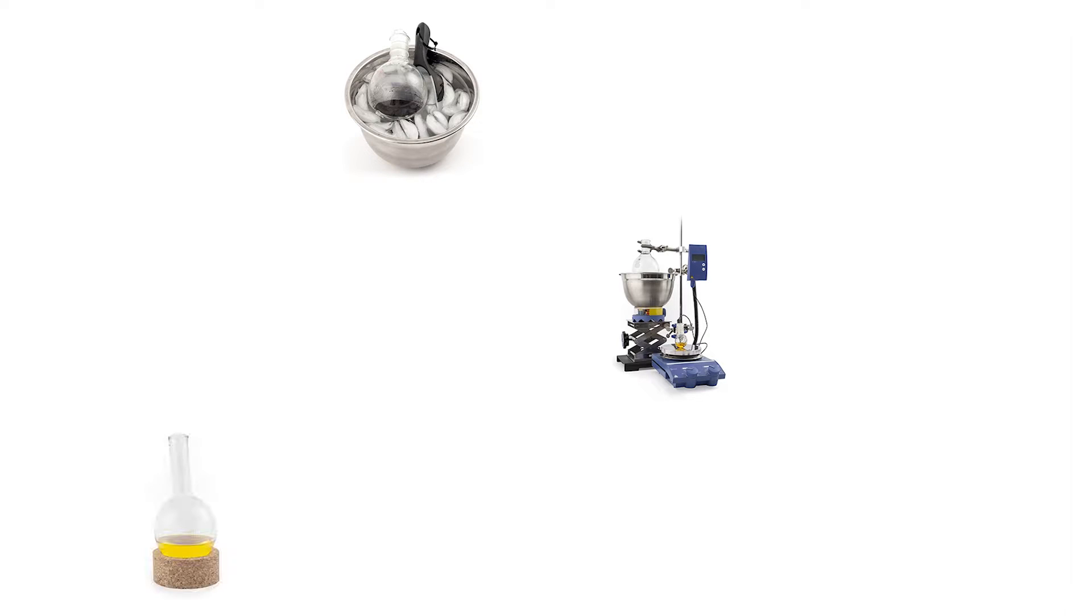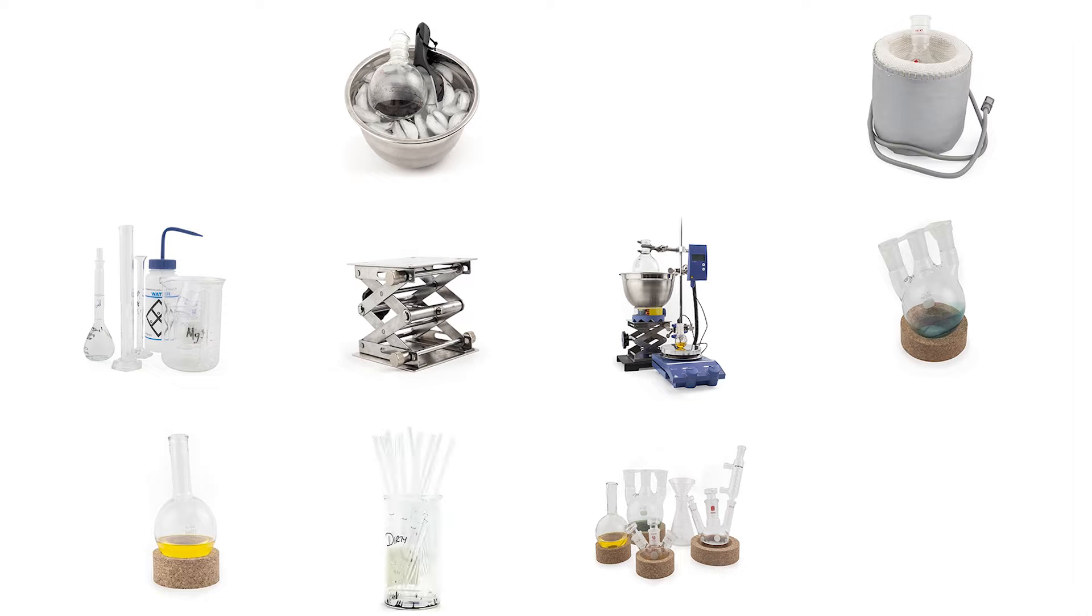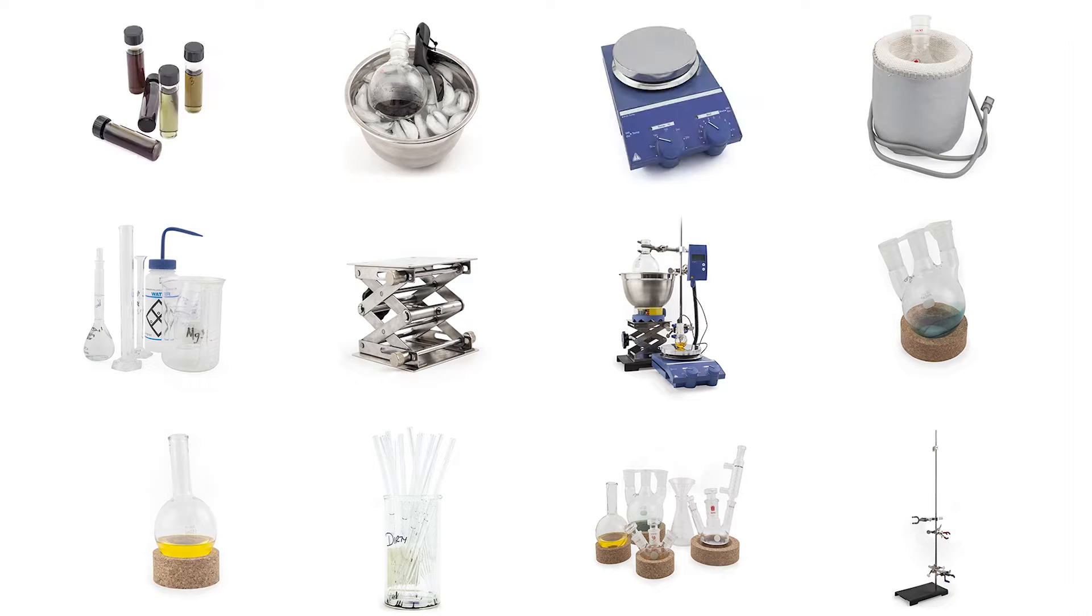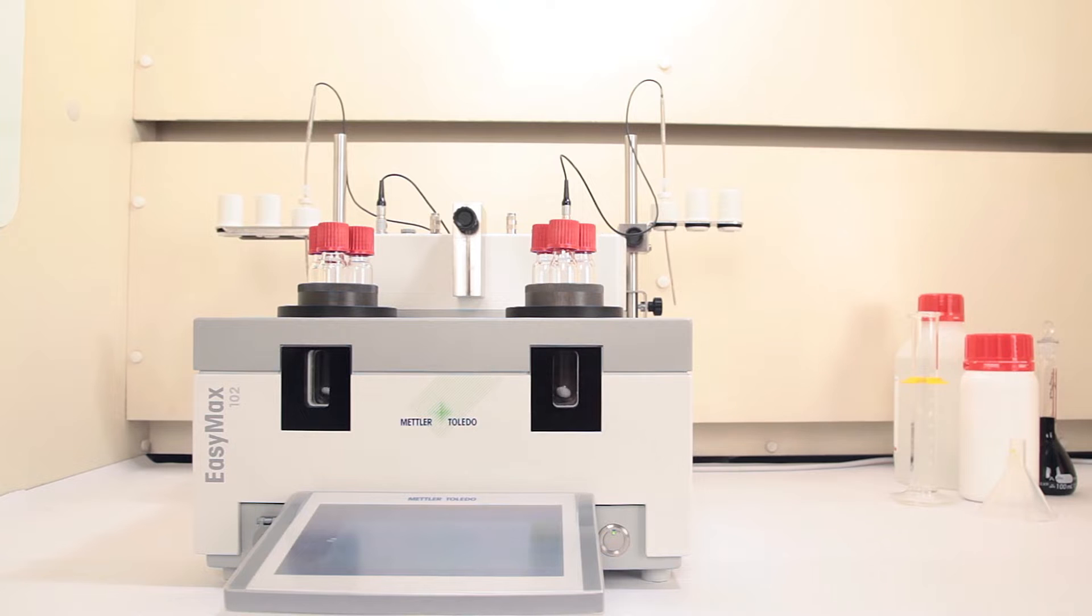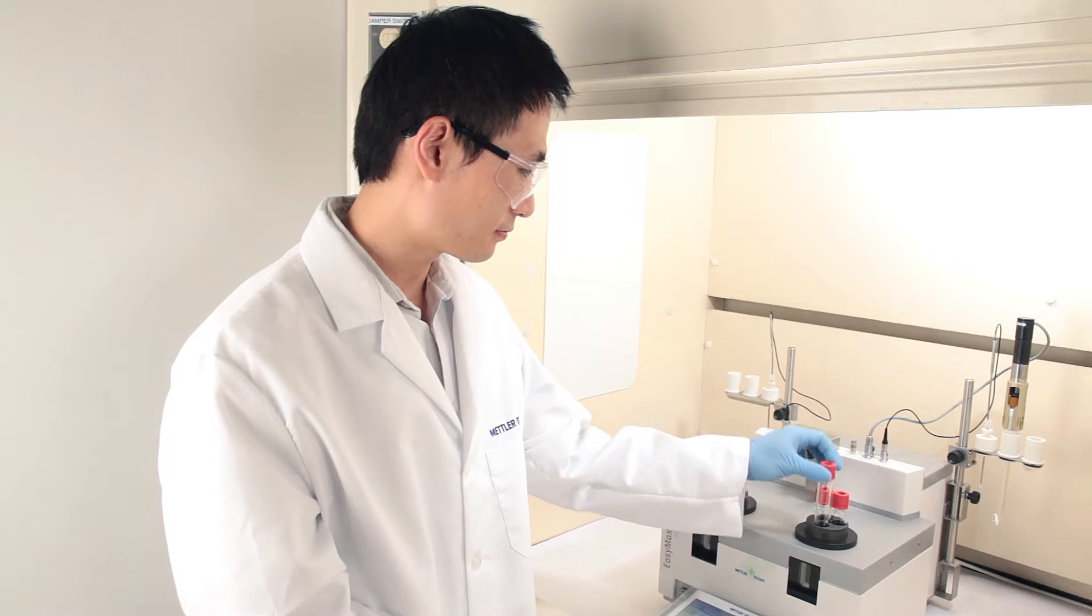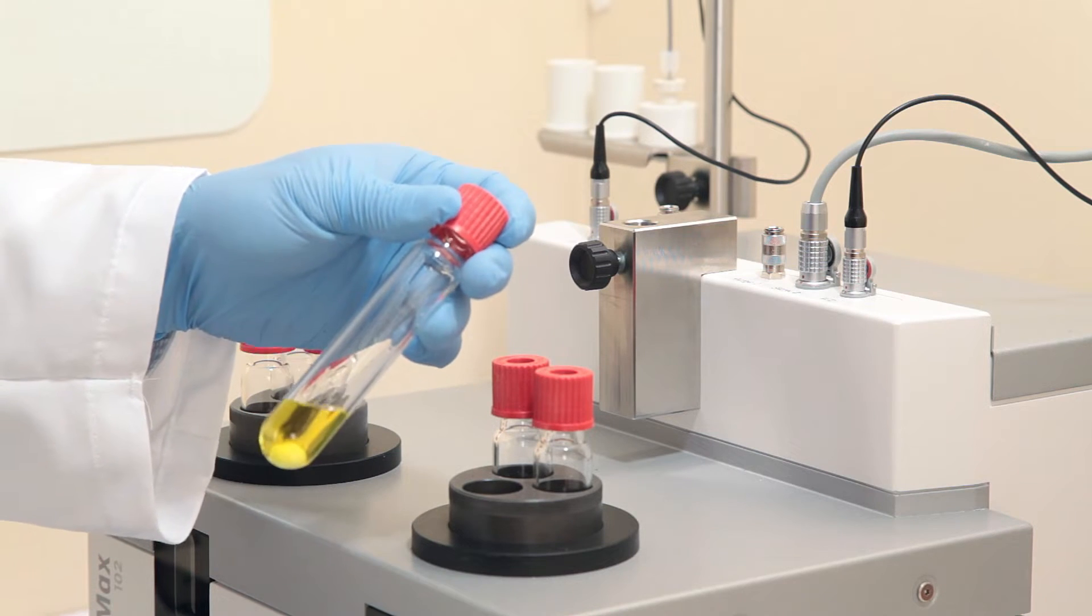Laboratory benchtops are filled with cumbersome and imprecise tools that make it difficult to develop new and innovative synthetic chemistry. EasyMax was developed as the complete synthesis workstation to address today's high demand for more elegant chemistry.